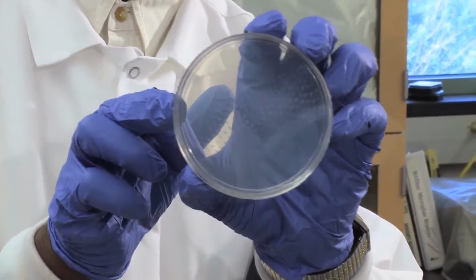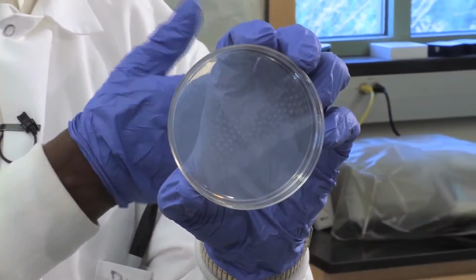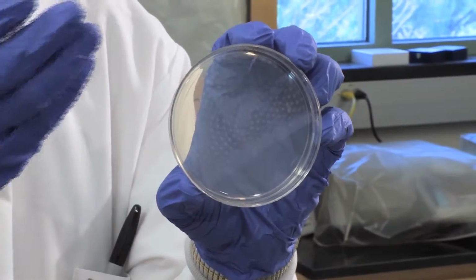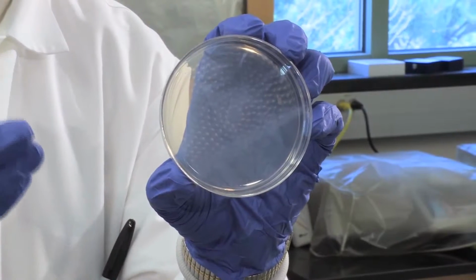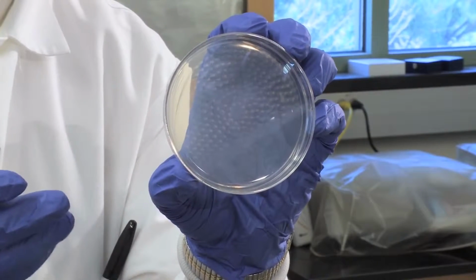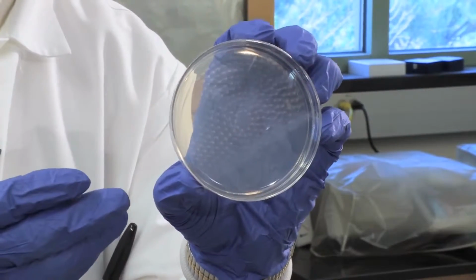So we will put this in the box and leave it for 5-7 days. And if there is any culturable, viable organism, especially fungal organism, then we might see some growth.